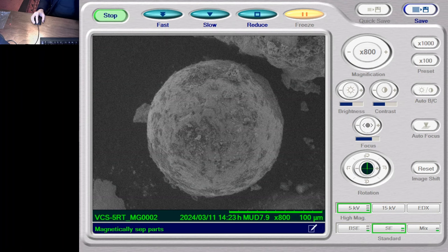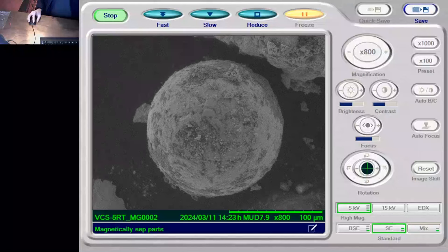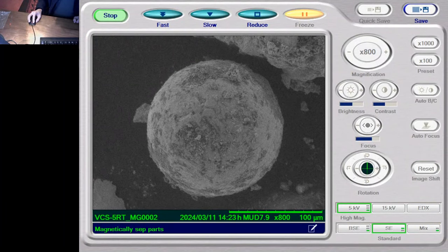So just to show this, there we go. That is the image there. And was this ever a crenellated iron-rich sphere? I don't know, but we're going to find out. So what I'm going to do is capture over here. No, I need to go to 15 kilovolts, don't I?